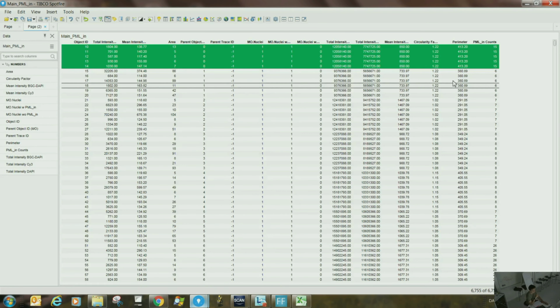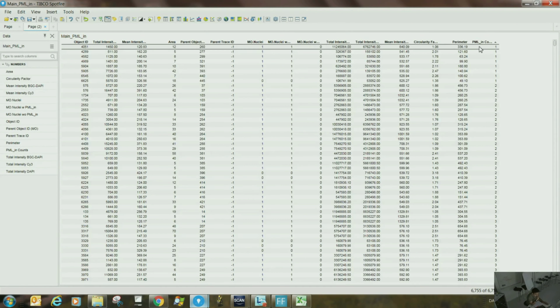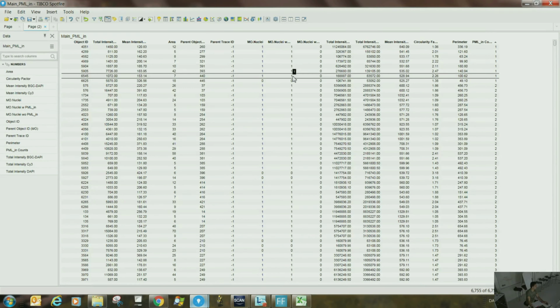So there are basically 15 such. Yeah, exactly. So there has to be 15 somewhere here. Yeah, so I'm sorting, but there has to be because we have used the same key. Okay, it's just that we have to sort it.